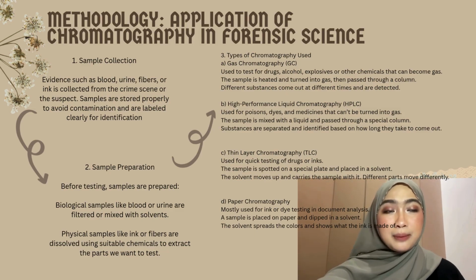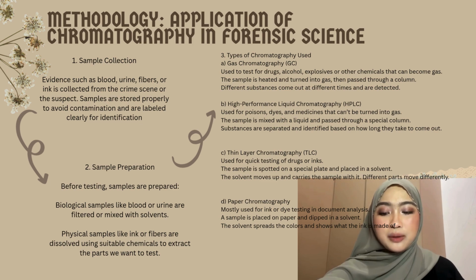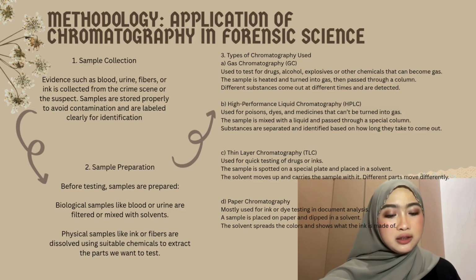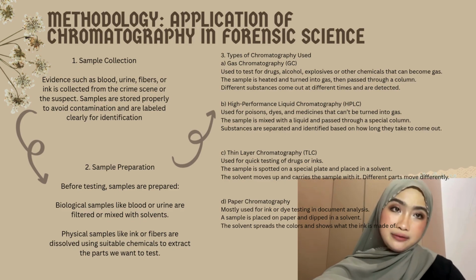And last is paper chromatography. Paper chromatography is mostly used for testing ink or dyes. We place a spot of ink on a piece of paper and dip it into a liquid. The liquid spreads the ink and separates its colors. This helps us check if two inks are the same or different.